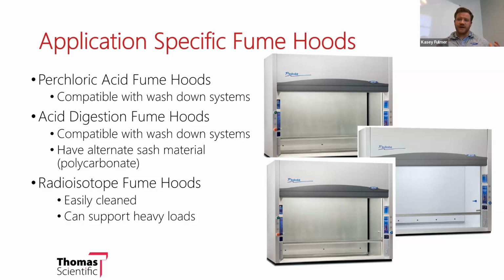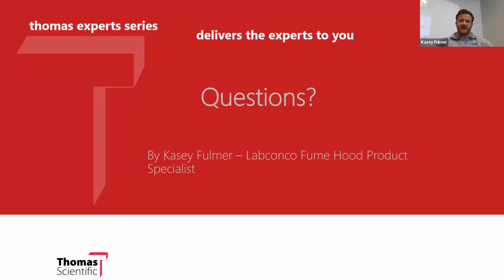So all sorts of different application-specific hoods that kind of make it easy. If you have a radioisotope application, there is a hood for that. If you have perchloric acid, again, hood for that. All of these things are to be considered. I hope this was helpful. If anybody has any questions, I believe we have time now. I appreciate you listening.